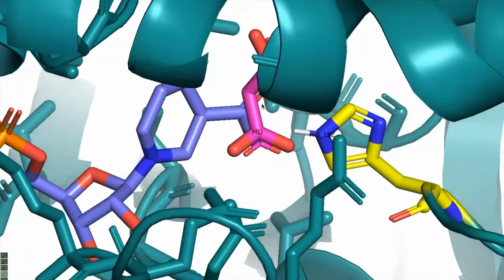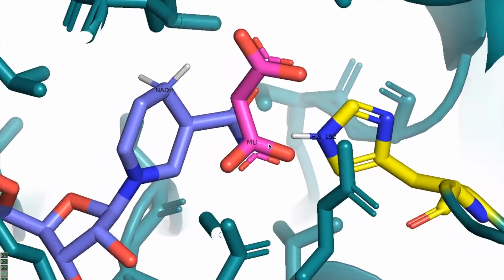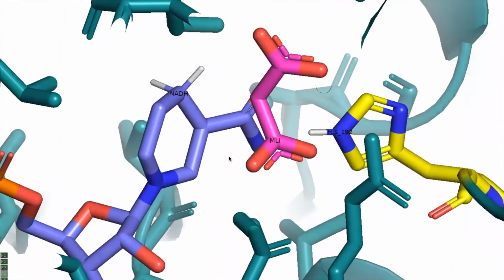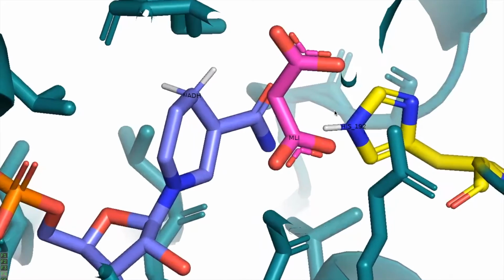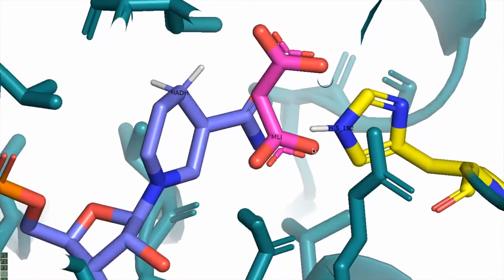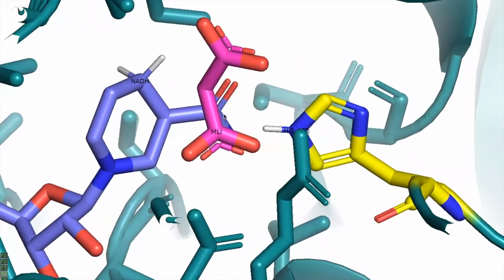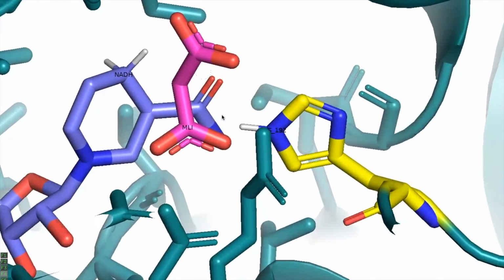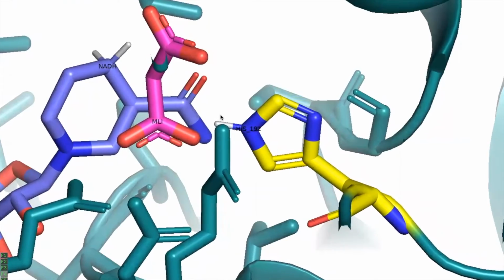If we zoom into the right side of the active site, we can see the main area where the reaction of turning pyruvate into lactate would usually take place. We have the ring of NADH, the malonate ion, and the histidine of LDH. Usually where MLI is located would be where pyruvate should sit in order to move forward with the reaction. However, MLI serves as an inhibitor of LDH, therefore preventing the conversion of pyruvate into lactate.